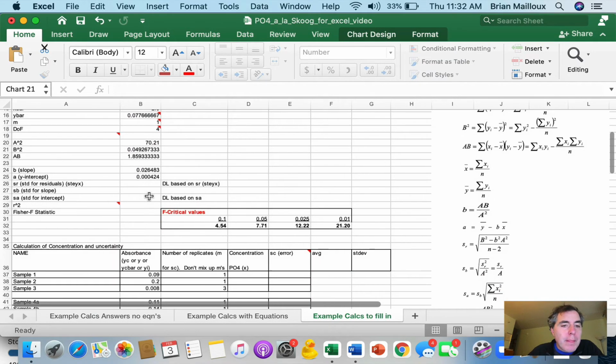So we're doing great. Now this is where things get a little bit tricky because now we want to start thinking about errors on things.